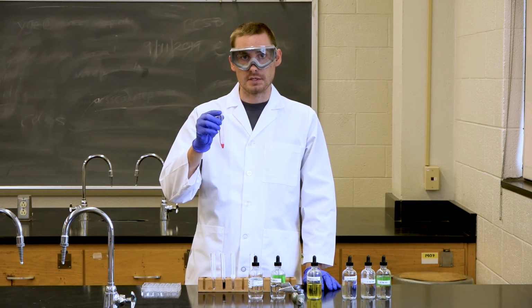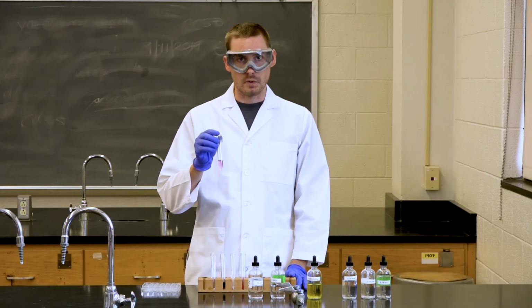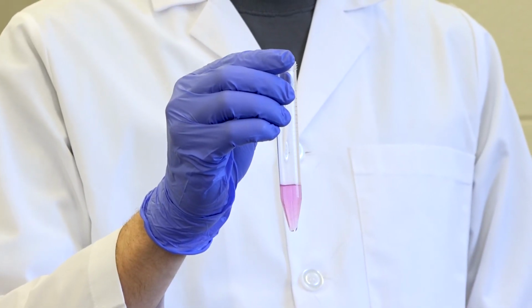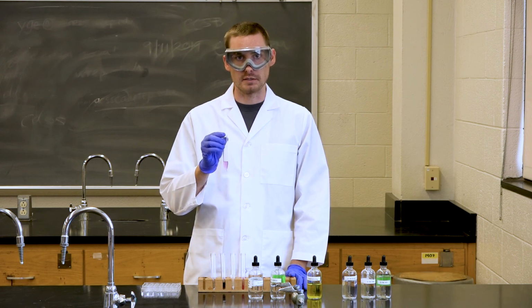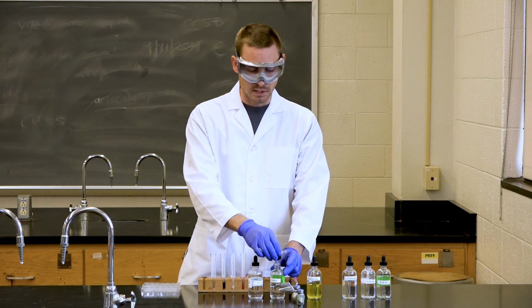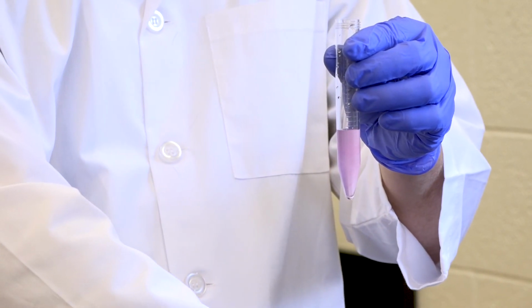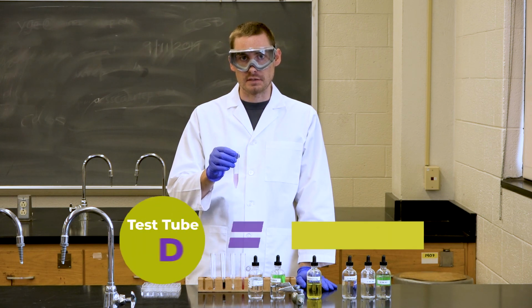This test tube we have already determined contains nickel because it's the only one that forms a pink precipitate upon addition with DMG. This final test tube contains what we think is barium. To determine that it is barium, once again, distribute some of the solution using a pipette into a well plate and then check it with the different reagents to confirm that it does match the pattern that is found in your lab book. What we will do though is add sulfuric acid and make sure that it forms a white precipitate. As you can see, upon addition of sulfuric acid, a white precipitate is formed, and we can indeed confirm that this is barium.